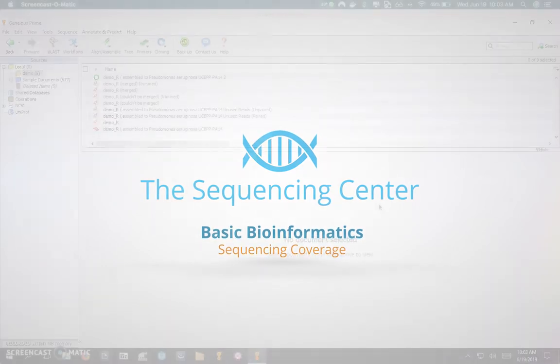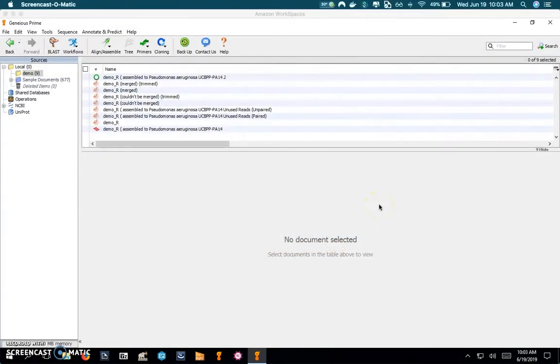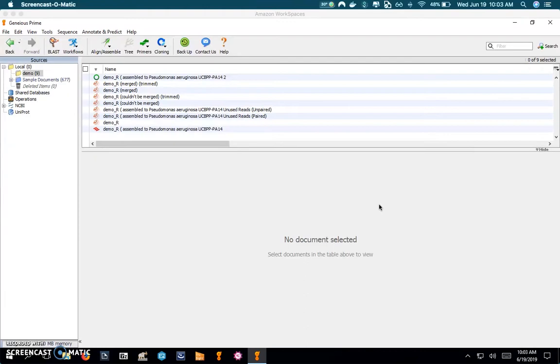Welcome to basic bioinformatics brought to you by the sequencing center. In a previous video we did an alignment of our sample reads against a reference genome, in this case Pseudomonas aeruginosa, and we're using the Geneious tool to look at the alignment and variant calls.